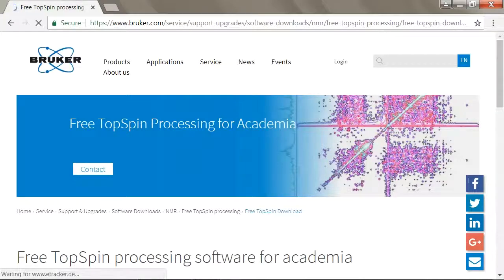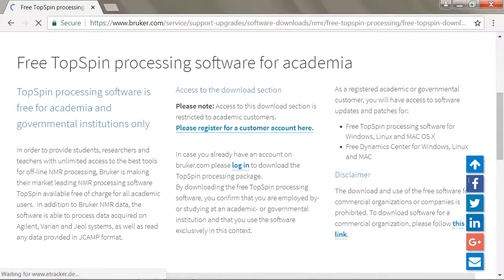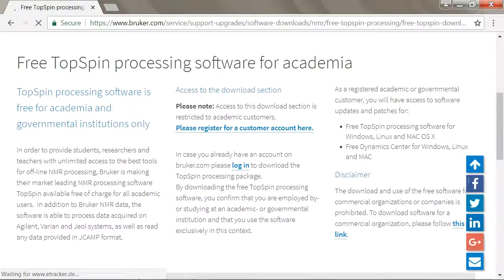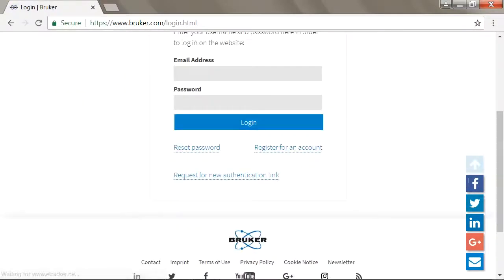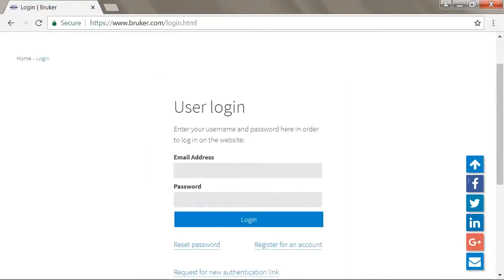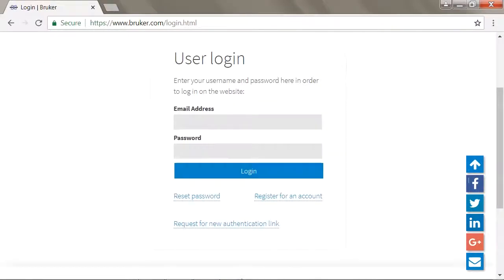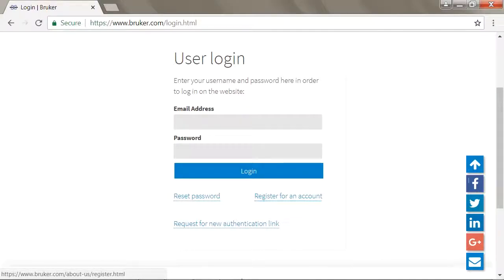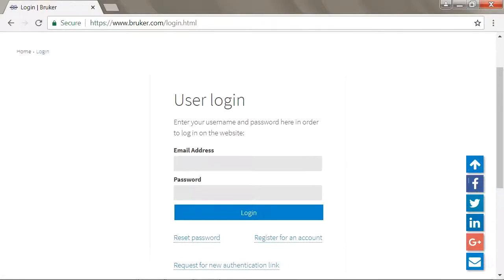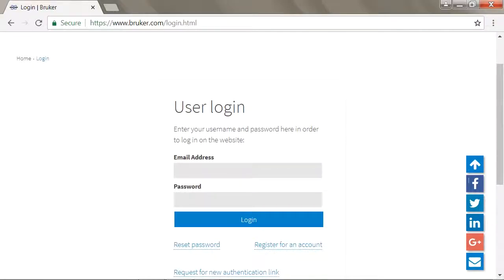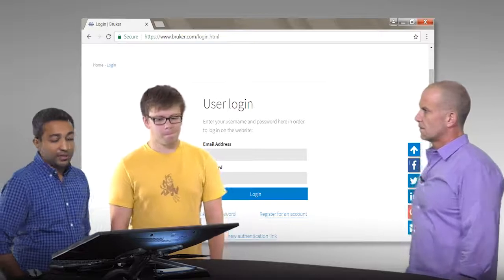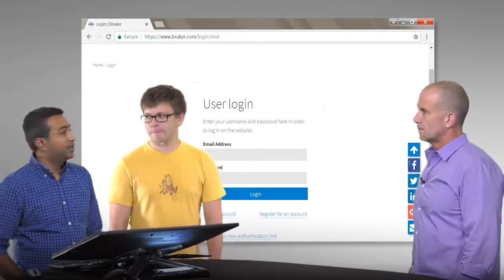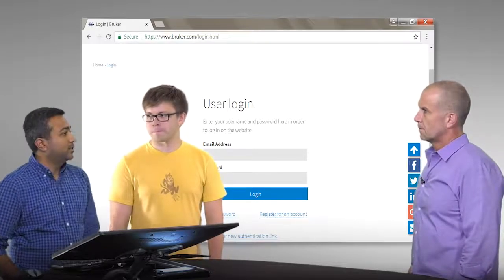So once you're here, if you don't have an account, you need to register for one. So once you go to login here, it'll go to the user login and you can register for an account here. And what do you need to be able to register for an account? Since this software is free for academics only, they require you to have a .edu email address. So just make sure you're using your university's email address because they'll send you a verification link to that email and verify that it's an edu account.